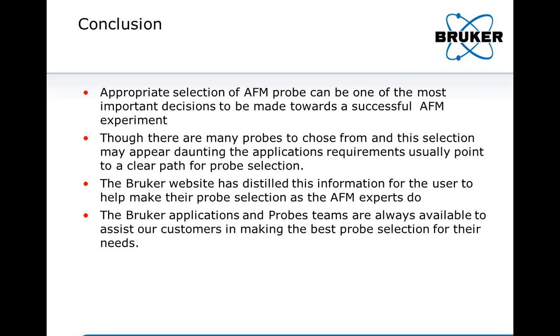Okay. So we're a little short on time, so let's make this the last question. Could you please recommend a Bruker probe for imaging live tissue in fluid? So this would be the same as the ones we recommend for cells. However, if your tissue is microtome thin, you can use a sharper probe. If it's thick, then you can use the same as for the live cells.